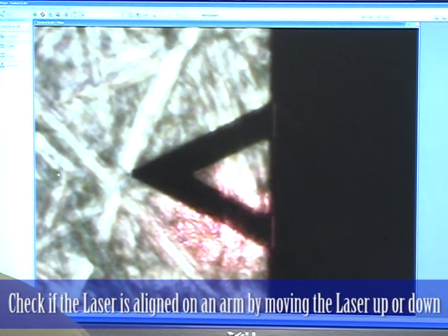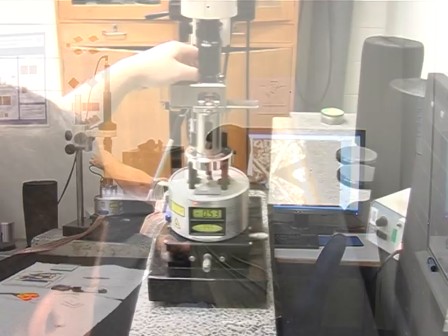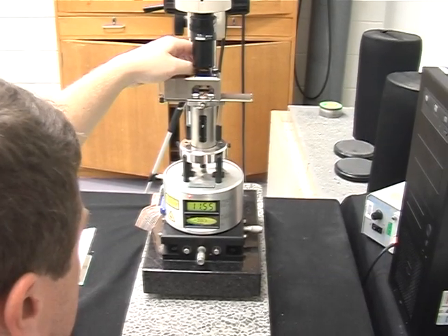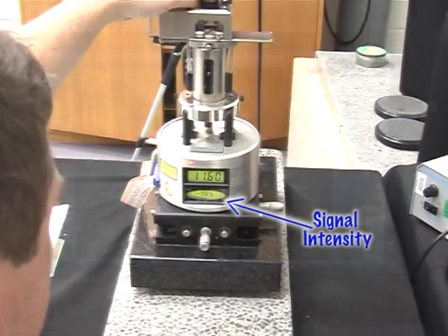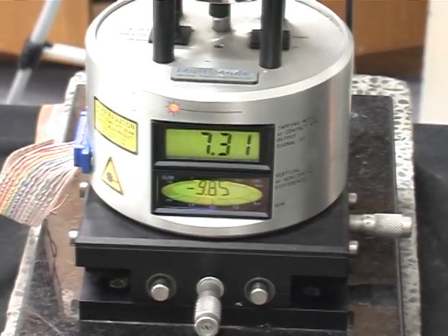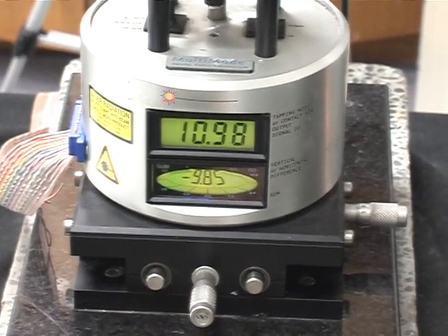If you have it aligned on an arm, then when you sweep up and down, the signal will go up, it will go down and then it will go up again. So as I go up, the signal on the detector would go up and you'll get a decent signal. Then when I'm in between the arms, the signal on the detector drops down. And then it will go over another arm and it goes up again.